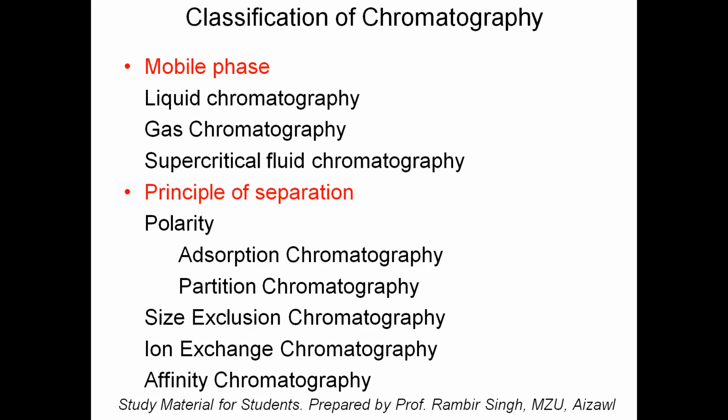When we created pores in the stationary phase, we regulated the size of the pores, so that the separation can be done based on size. One size can be excluded and one size can be included, and with that concept we get separation.